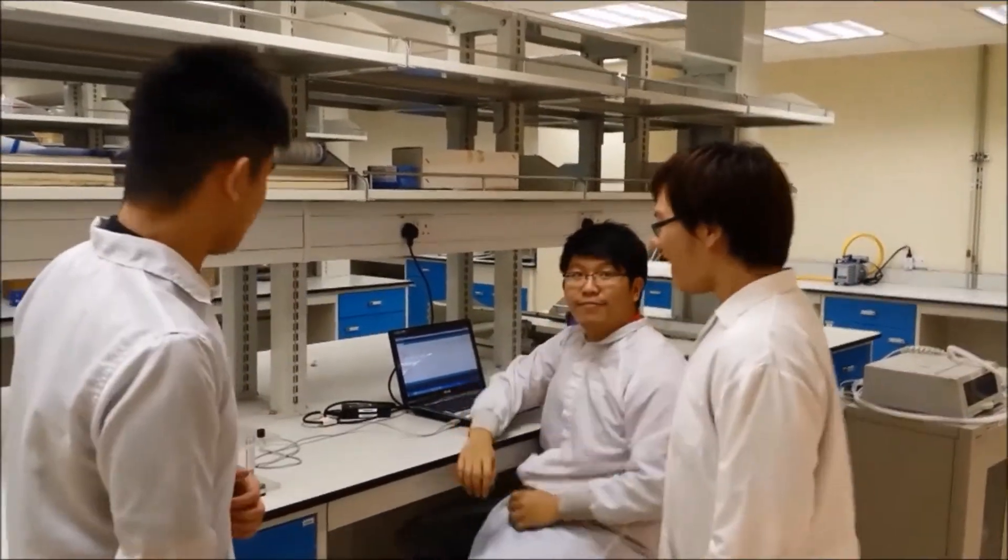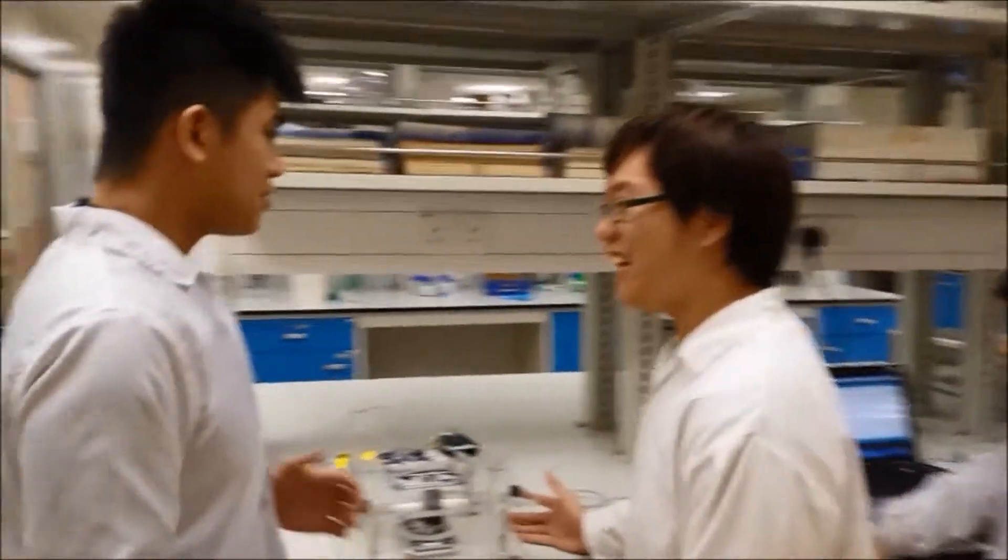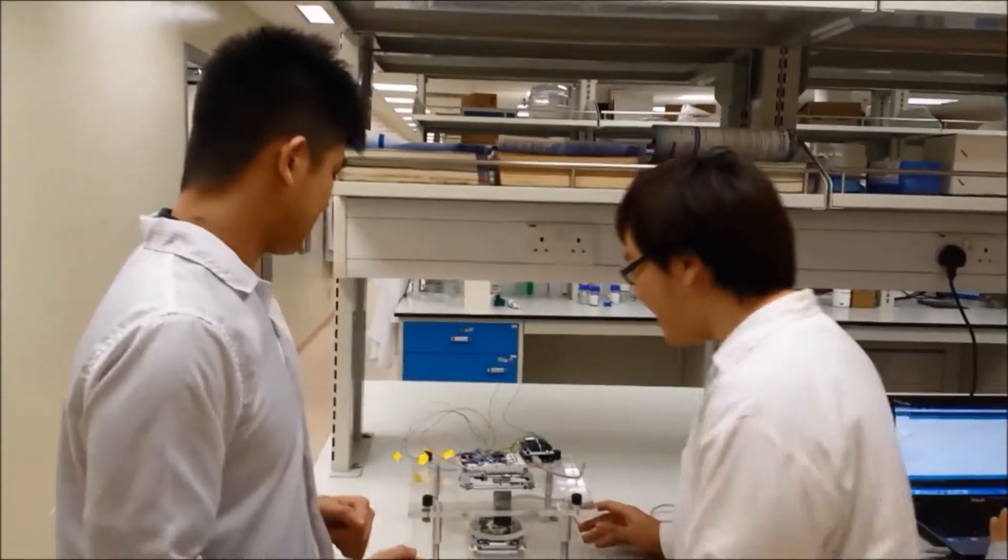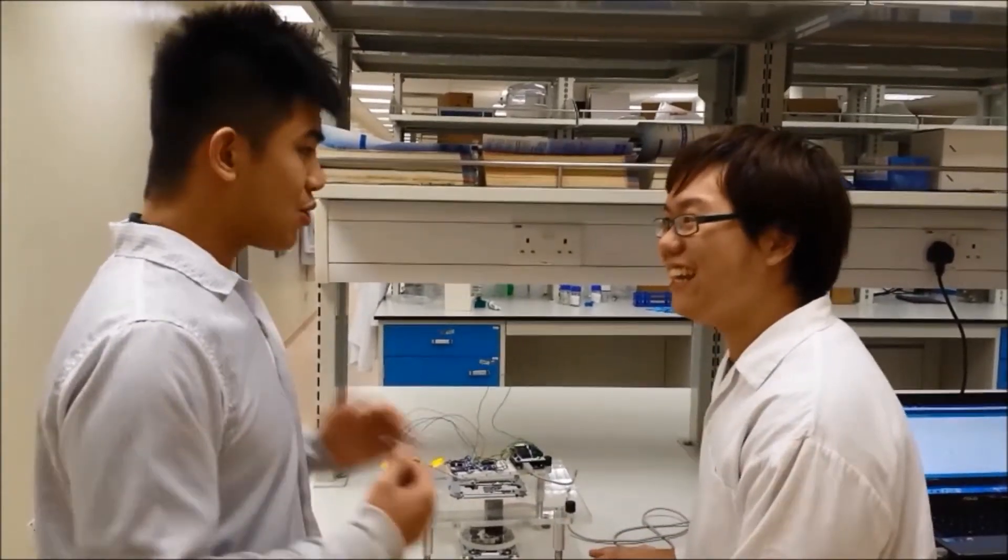Hi guys! So is this a bioprinter? Yup, this is our DIY bioprinter. Wow, so fascinating! Can you tell me more about it? Sure, why not?